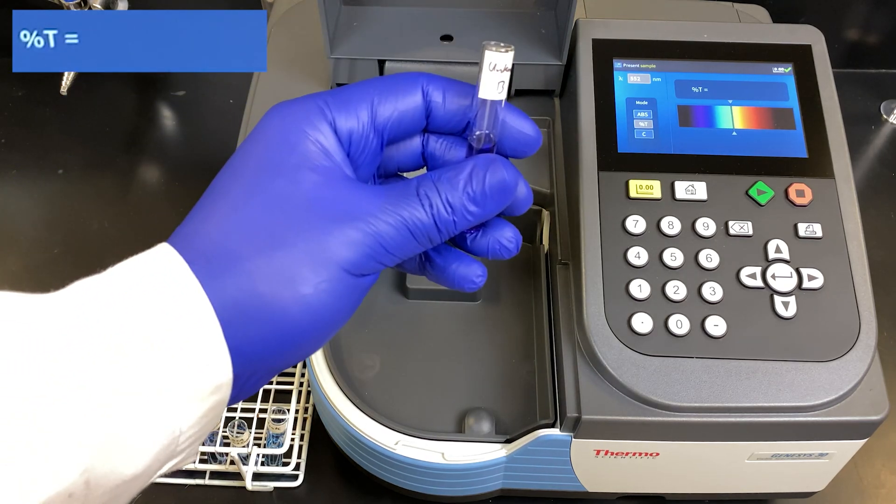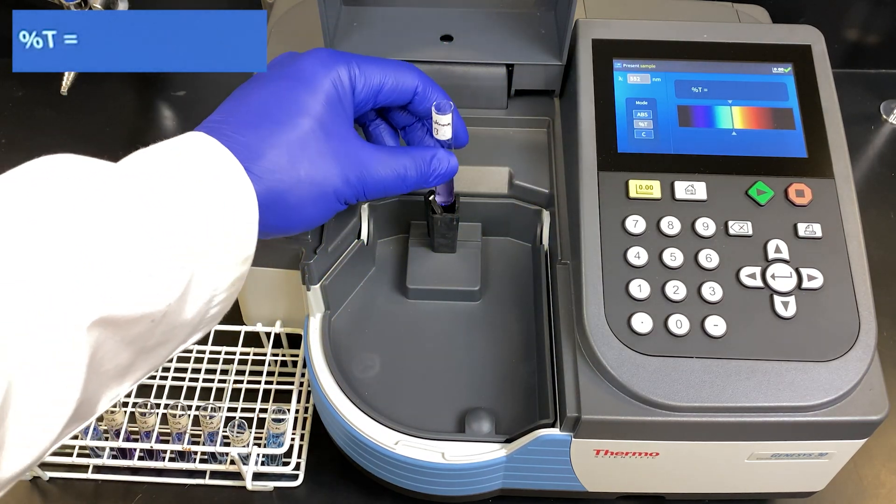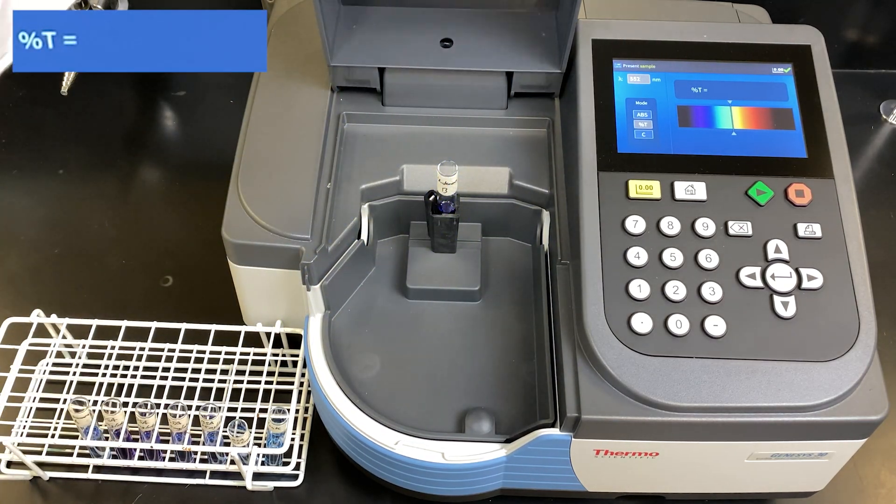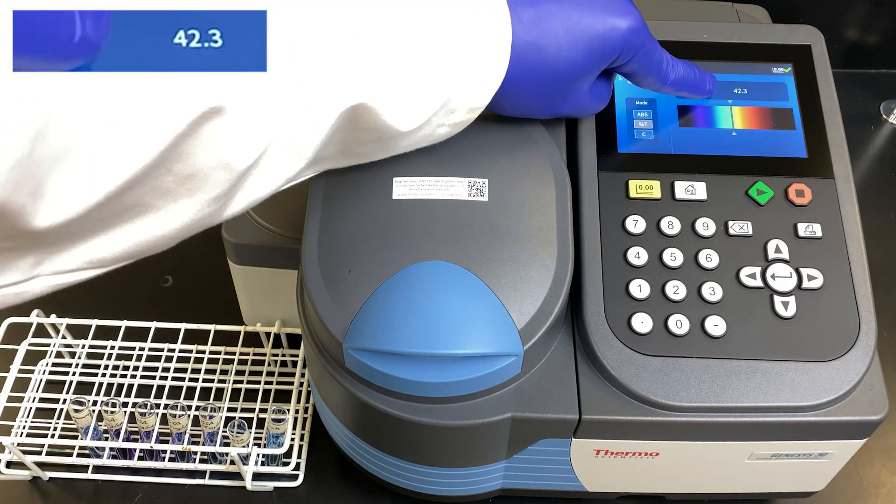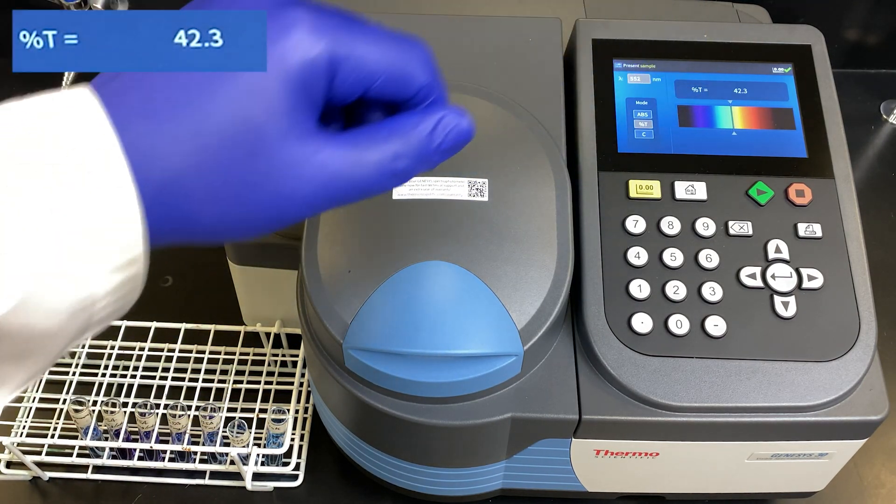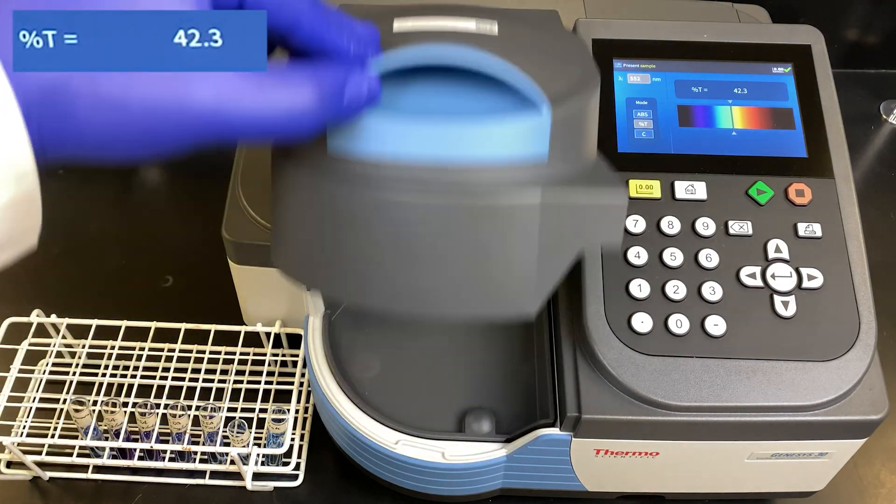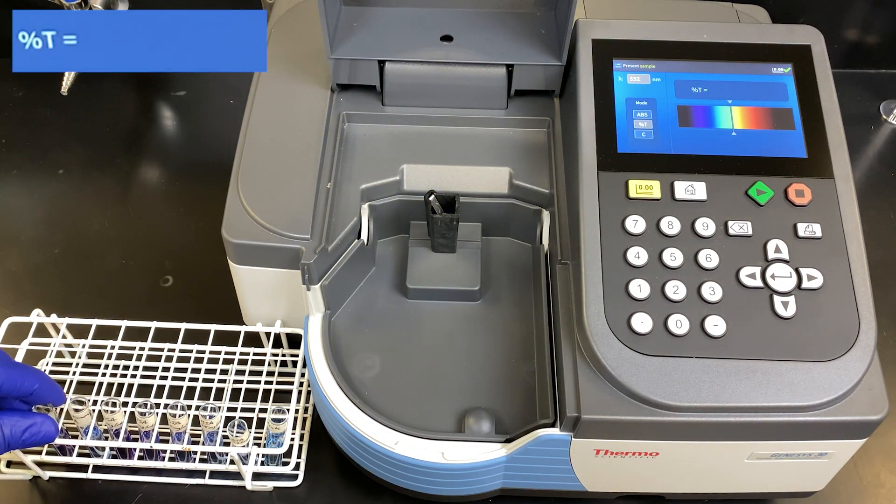Unknown B now, the darker colored one. Wait for it to stabilize. 42.3. Now, plot that on your standard curve and determine what the concentration of the unknowns are.